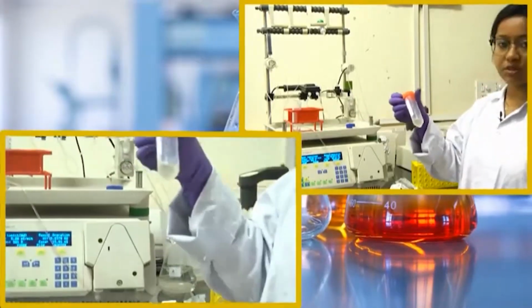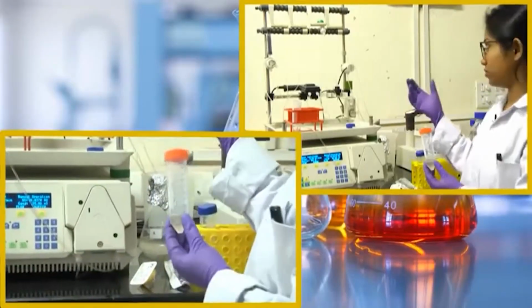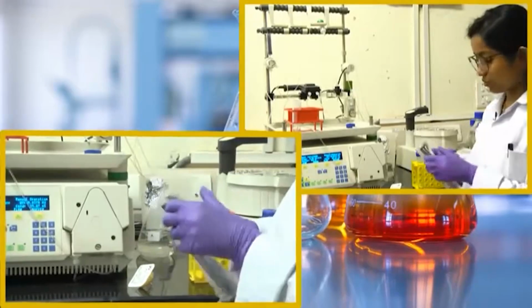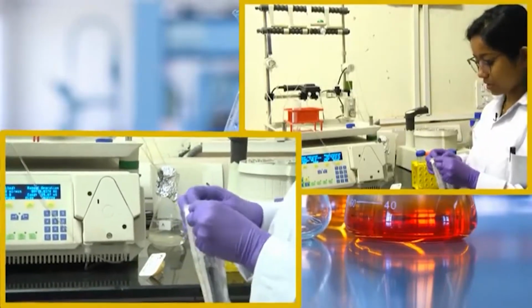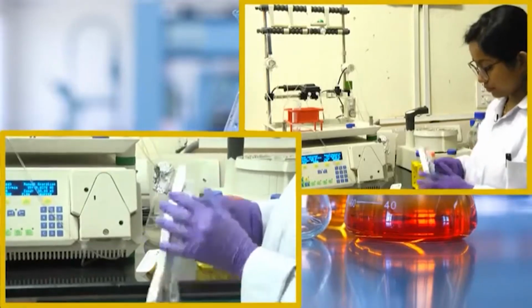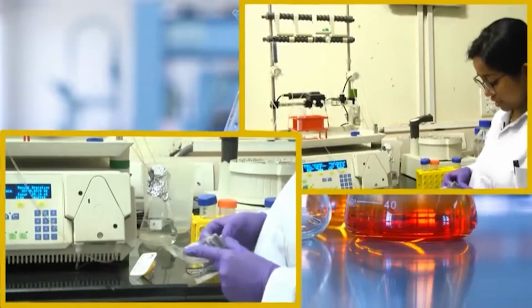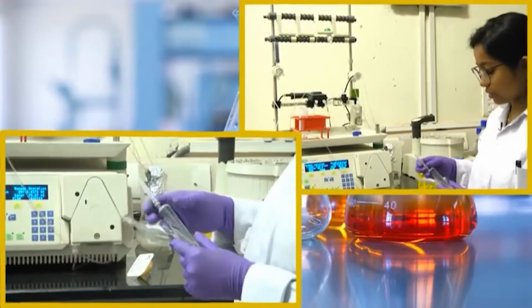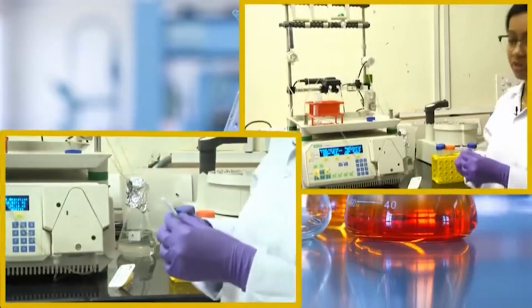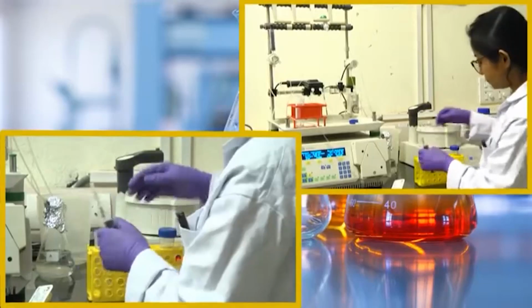Now, I have taken the supernatant solution, but I cannot load this solution to the column right now. As shown before, I need to pass this whole supernatant solution through a 0.22 micron filter. That will ensure that any cellular debris or big particles present in the solution will not clog up my column.